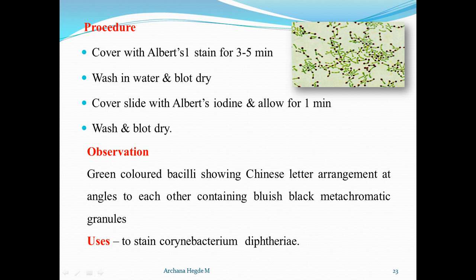This is one of the techniques used in hospital laboratories. As it is seen, the green colored bacilli showing Chinese letter arrangement at an angle to each other containing bluish black metachromatic granules.